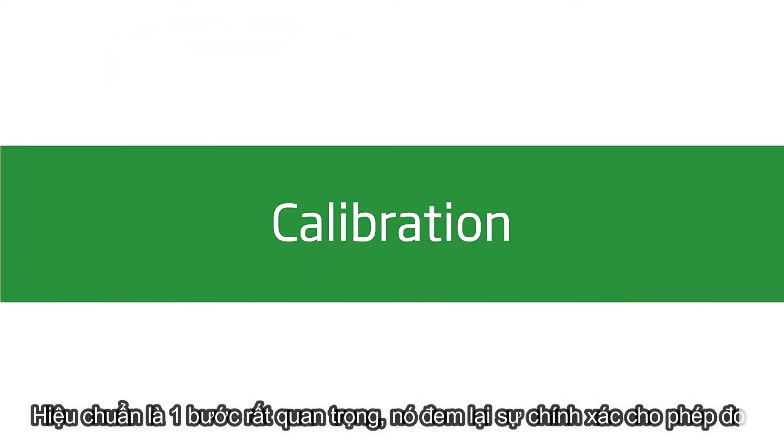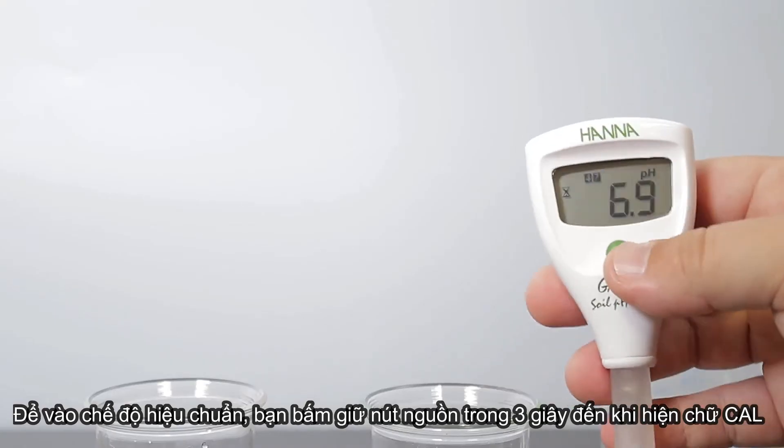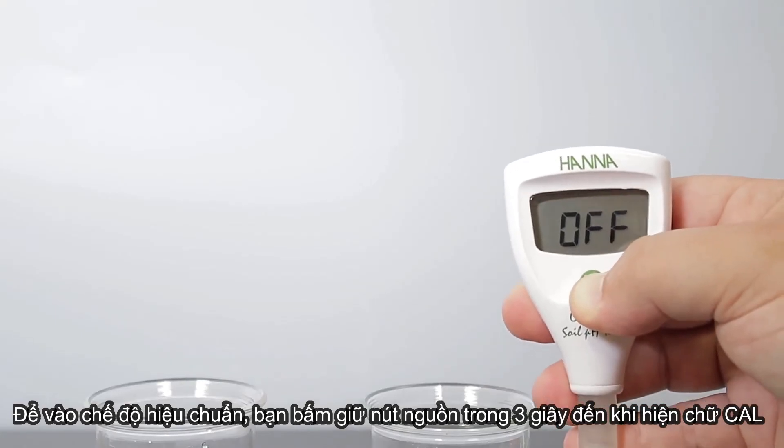You are now ready to begin calibration. Calibration is an important step in ensuring accurate results. We recommend calibrating before each use. To calibrate your tester, press and hold the button for 3 seconds until Cal appears on the screen.